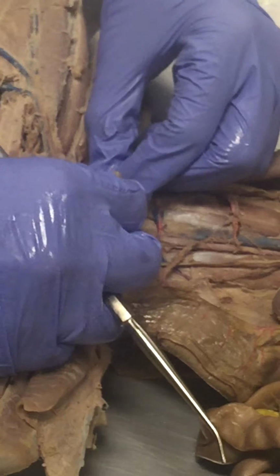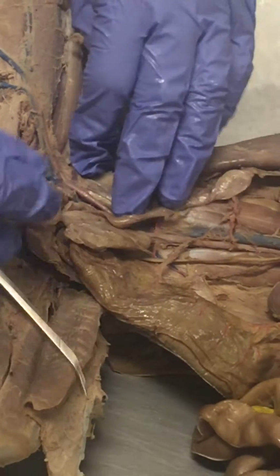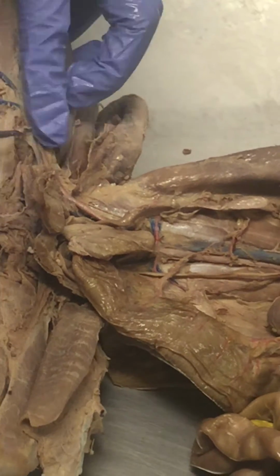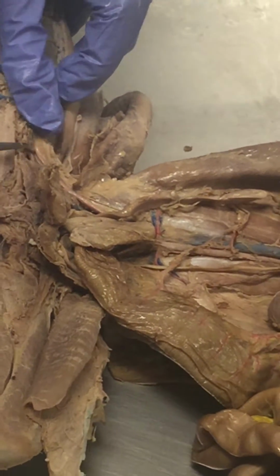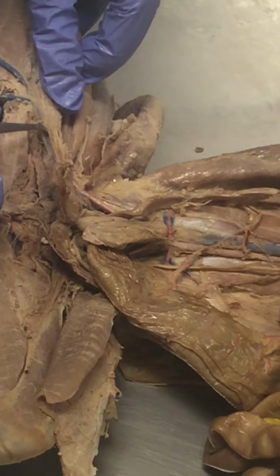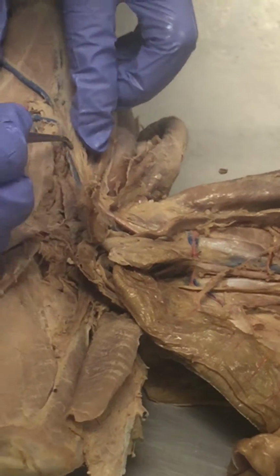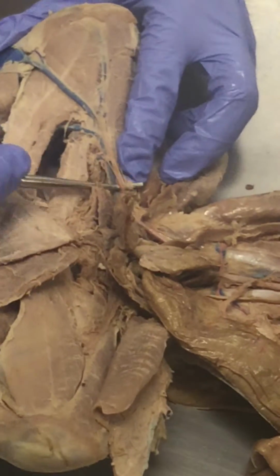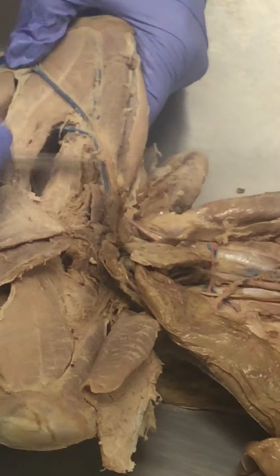Right where I cut, that was the inguinal canal that I just cut open. So once we come out here, I'm not going to ask you about the humeral circumflex in a cat or profundifemoral. The only thing I'm going to ask is the femoral artery. So the femoral artery is out in the leg here.